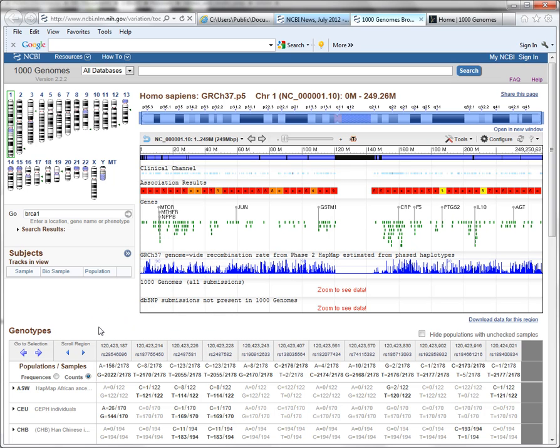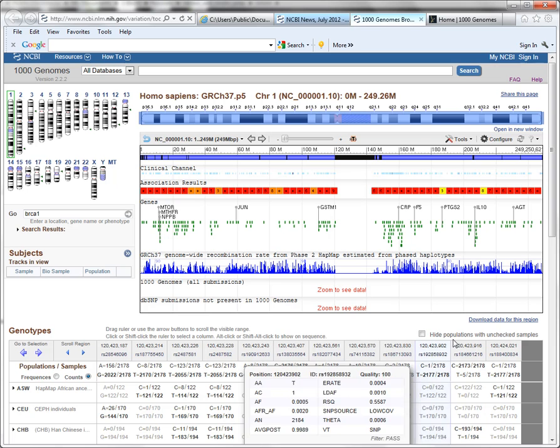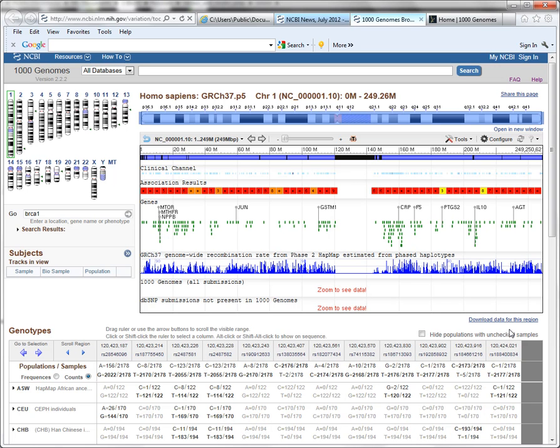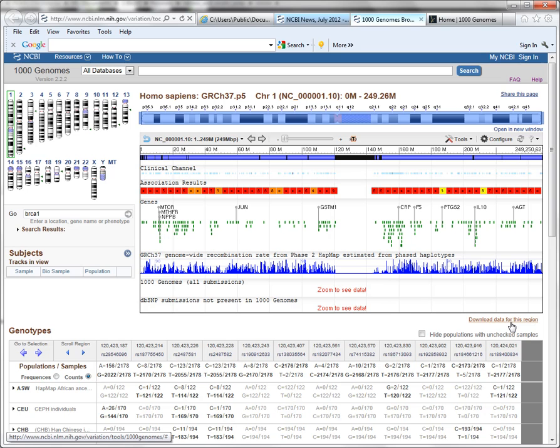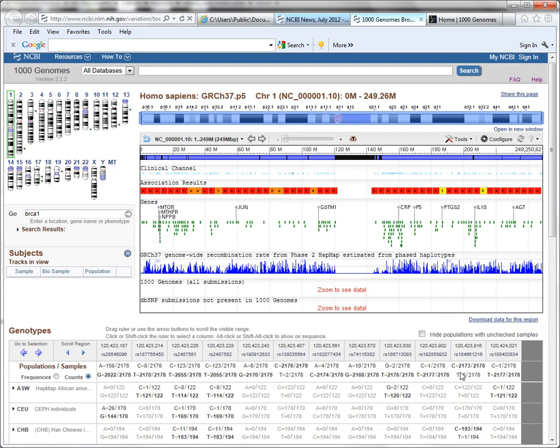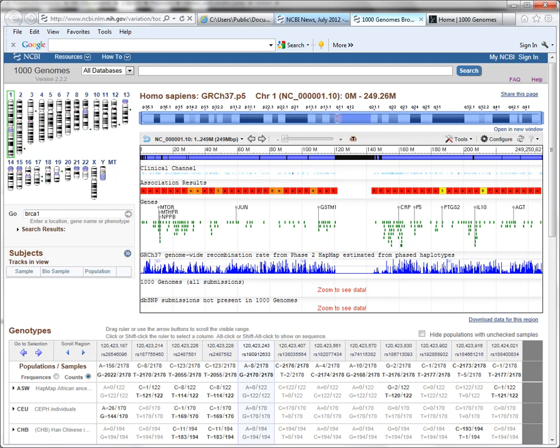And the final widget that's important to know about is download data for this region. So if you get this displayed exactly the way you want, you can download the information that you're viewing for further use and analysis.